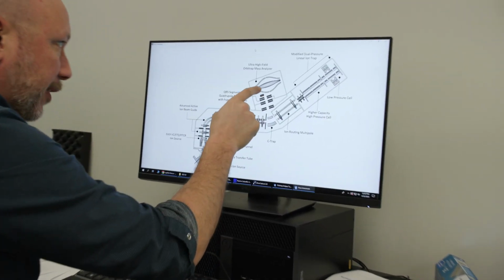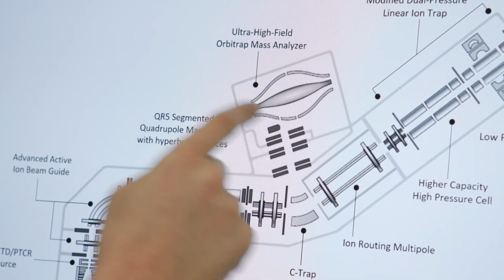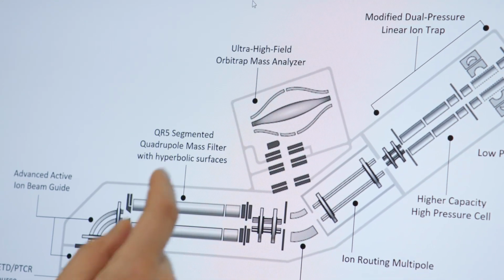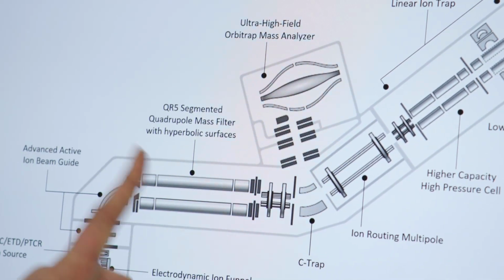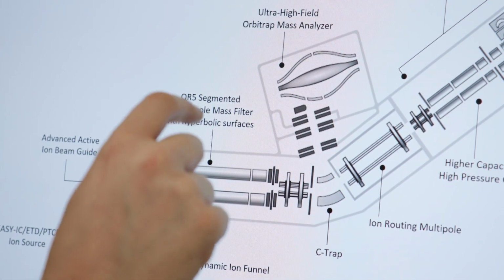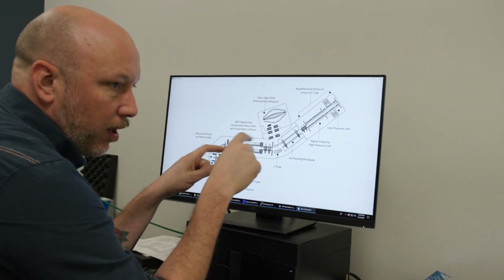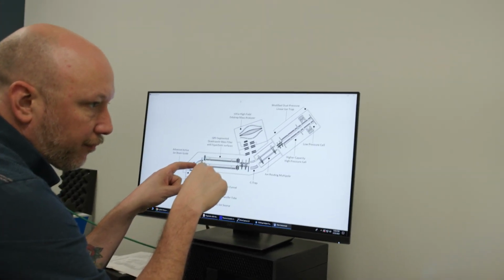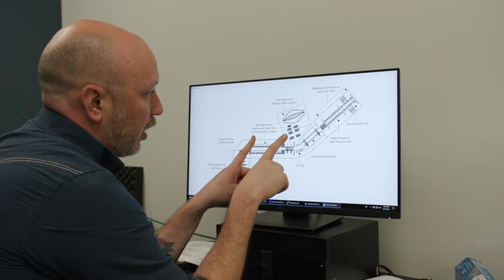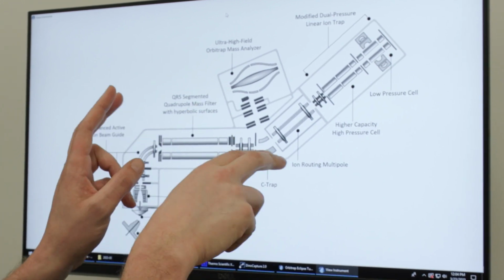And then they have another mass spectrometer called an Orbitrap mass spectrometer. So this is not quite as fast or as sensitive, but the resolution is really high. So in the Orbitrap mass spectrometer, we can tell the difference between a C12 and a C13, or a nitrogen 14 and a nitrogen 15. That seems like it's just one additional neutron, but we can actually measure the energy in the nucleus that's keeping the nitrogen or the carbon isotope from each other.